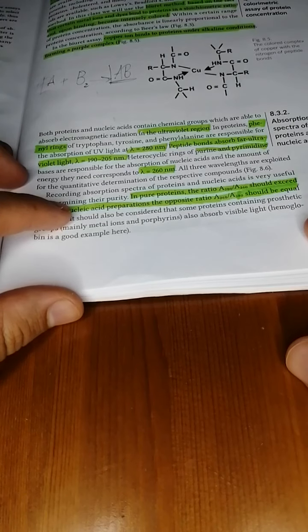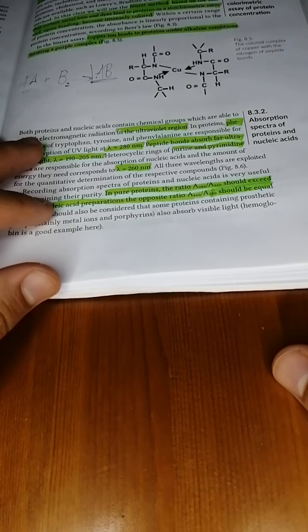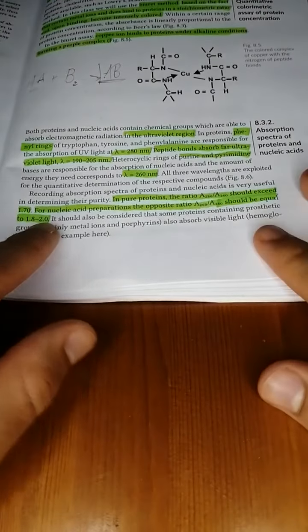So yeah, what else do we talk about? Mixtures of proteins and nucleic acids. We know that pretty much all nucleic acids are present in a mixture with proteins, because of either histone wrapping or other proteins essential for the structure of the nucleic acid. But how do we figure out how much protein there is compared to the nucleic acids?